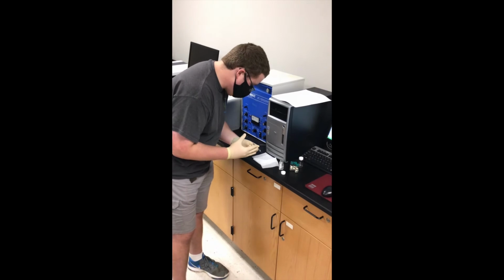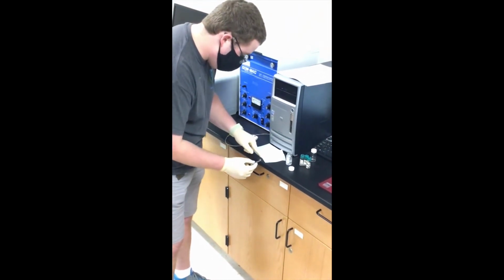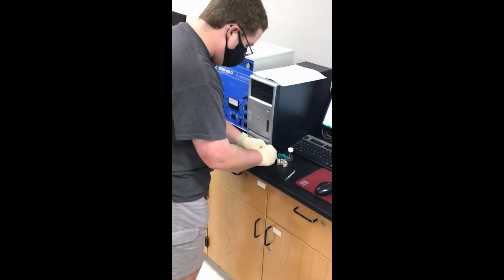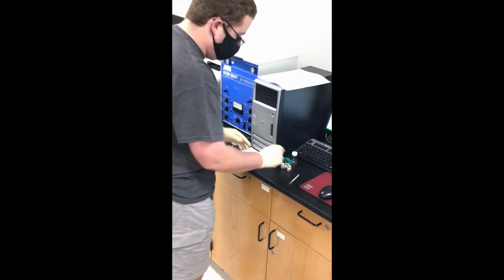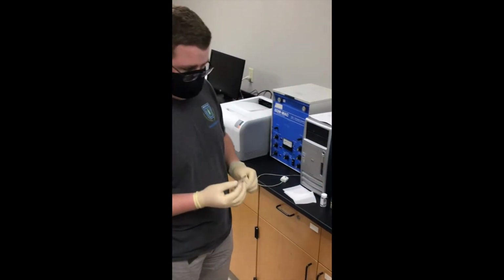I pulled up some hexane, and now I spritz it onto the chem wipe, and the chem wipe is now wet, and I can verify that there was liquid inside of the syringe. So now, I shouldn't have to worry about that in particular unless it clogs on this particular run. But for now, I know that this syringe is working.